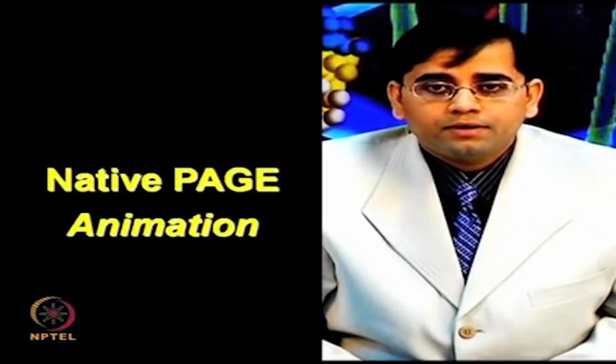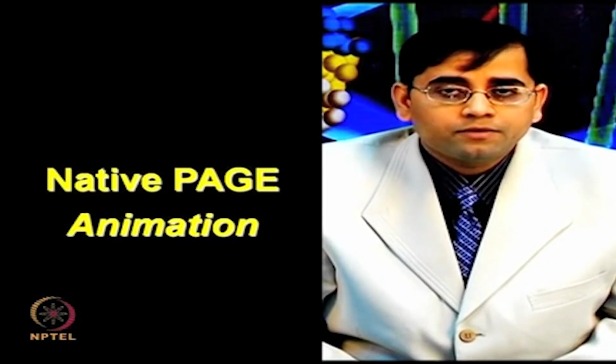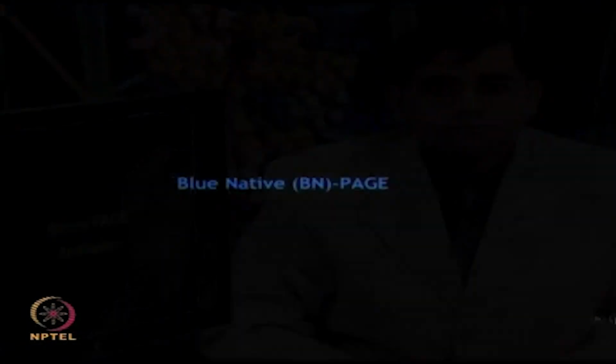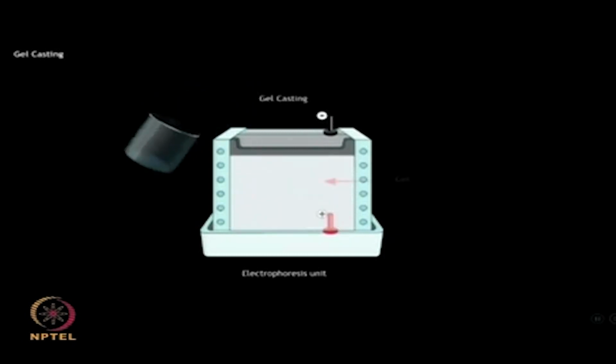I will now show you an animation of how to perform the native polyacrylamide gel electrophoresis, blue native PAGE or BN PAGE. The polyacrylamide gel is cast between the glass plates as a vertical slab in the same buffer that is used for electrophoresis.